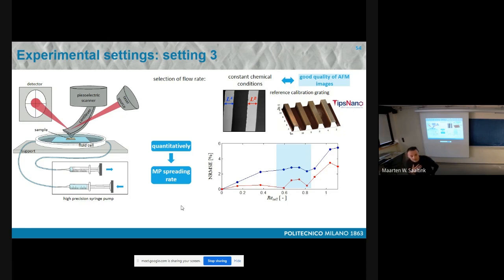Okay. I can tell you my answer and then you can add on. My answer is the following. I might agree, however, you just don't know where the nucleation of the pits starts arriving. It means that, at least the way that I conceptualized it, you actually have two random fields, the pits and the terraces. That's why. Therefore, it is conceptualized as a composite system with two random fields. Otherwise, if you want to treat them separately, first you need to identify where the pits are, separate them from the terraces, and then perform the analysis. So it's a two-step system.